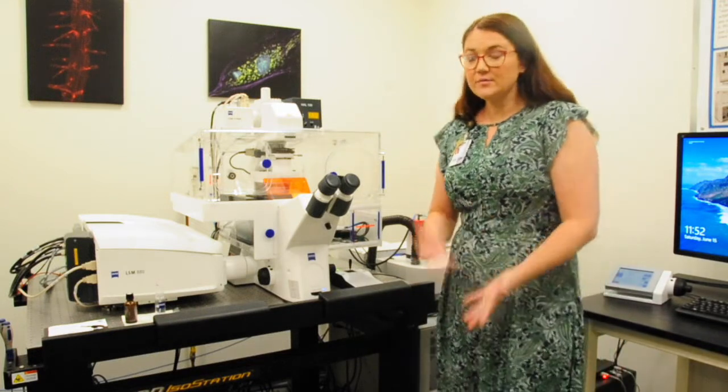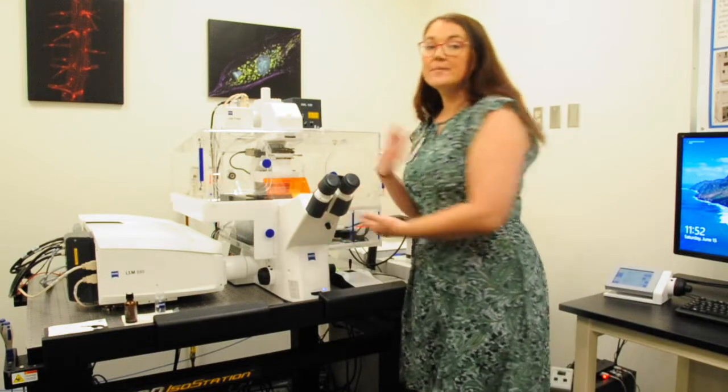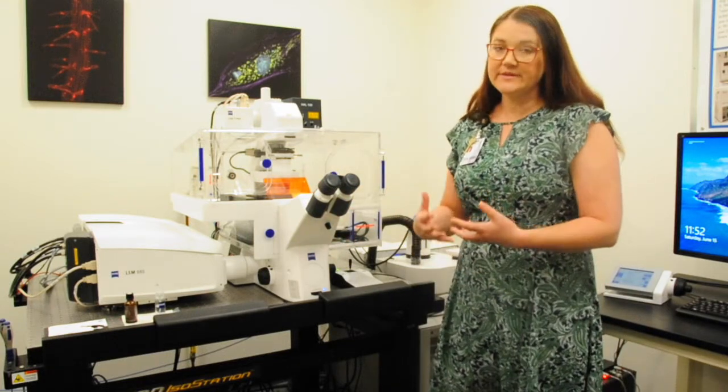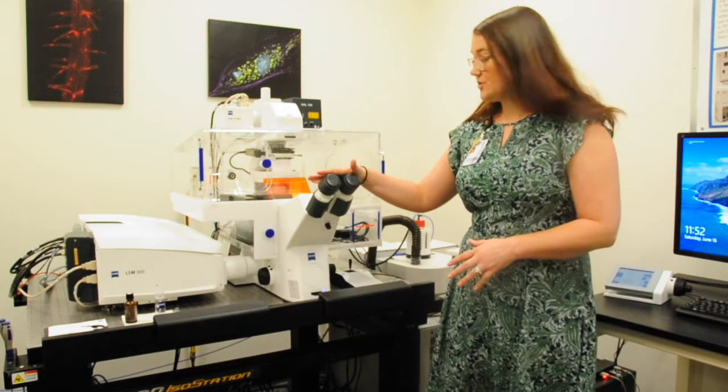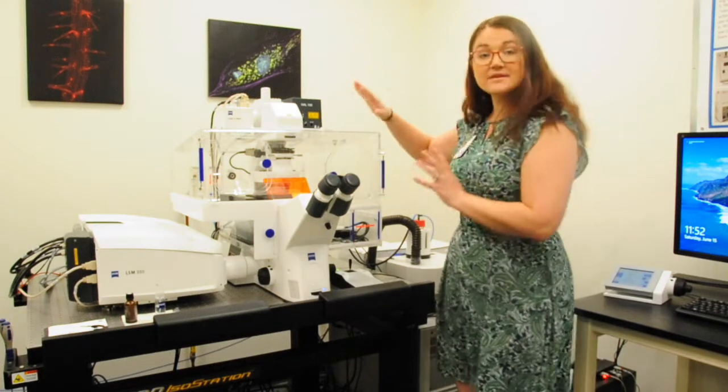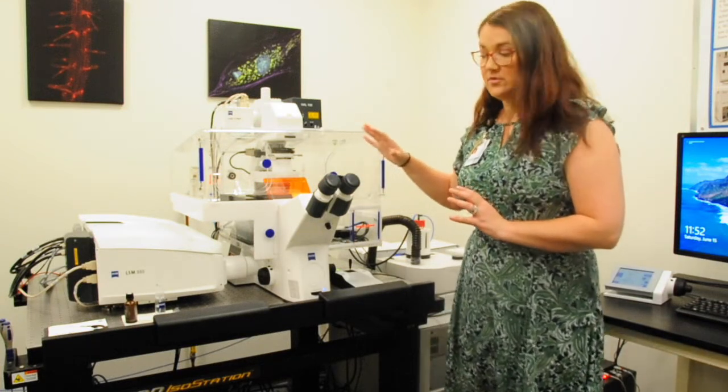To start off with, we have an inverted microscope. Because we are a core facility, it gives us the most flexibility to have an inverted microscope, and then everything is built off of there for the confocal microscope.